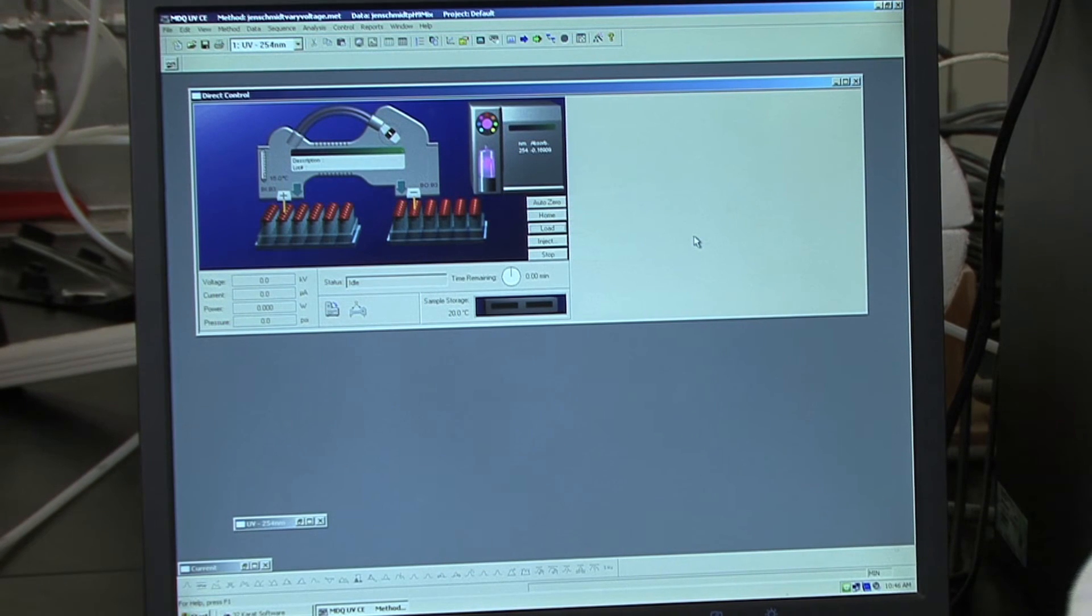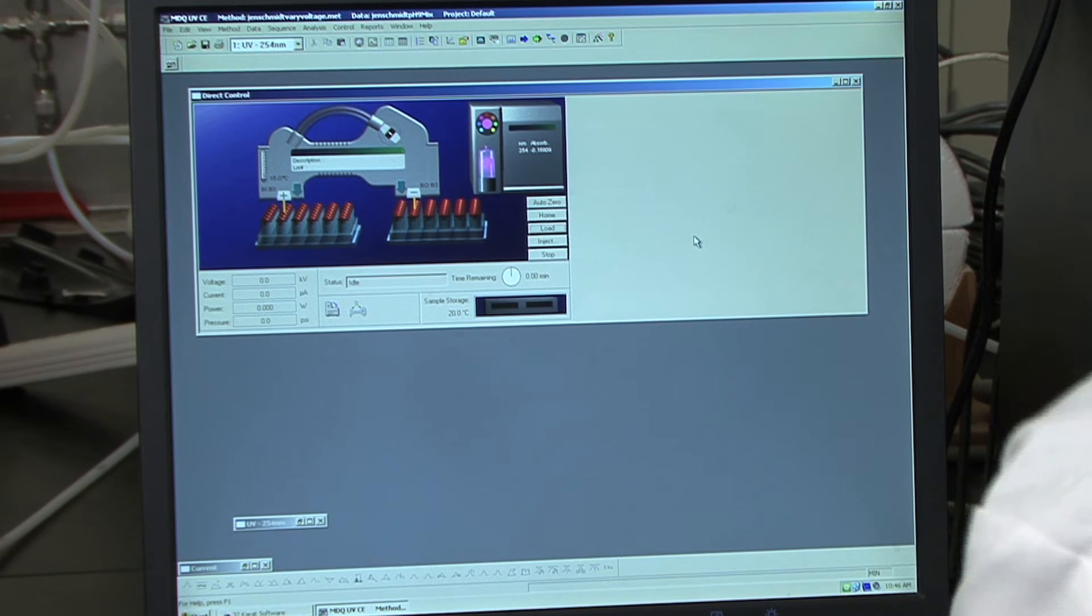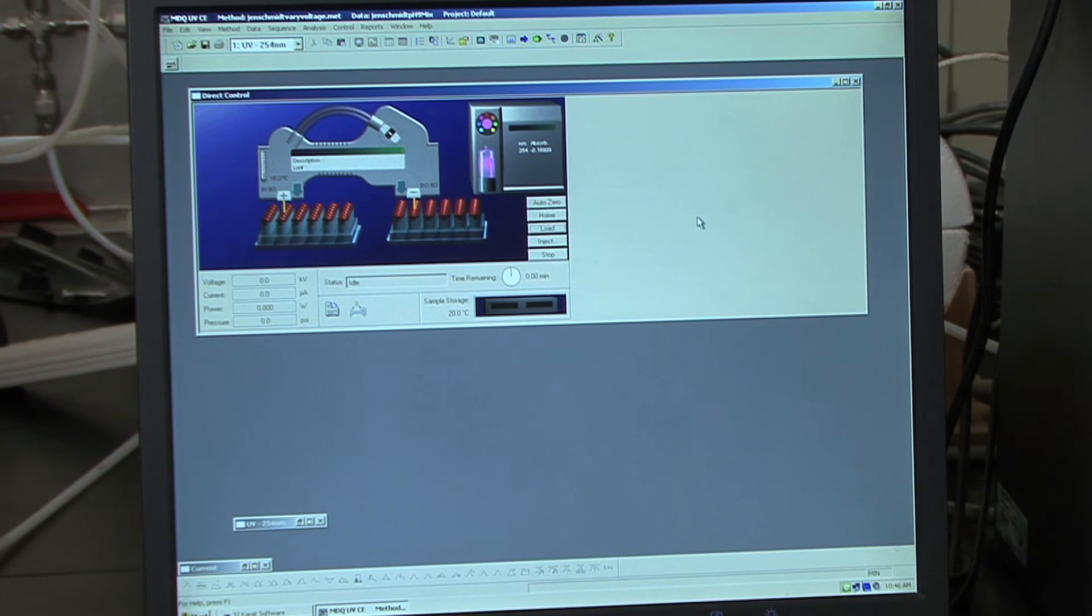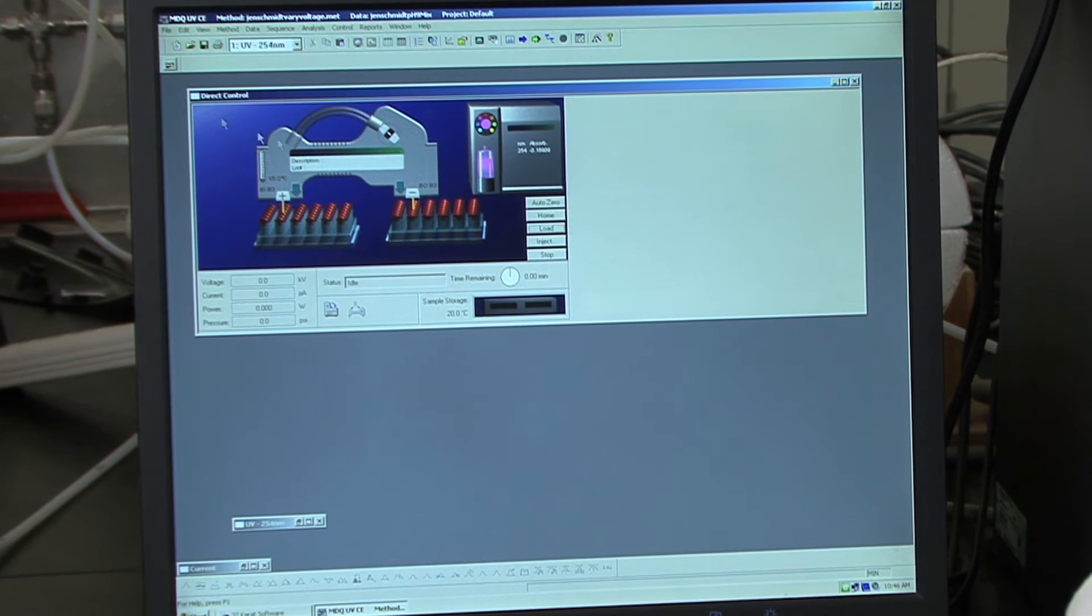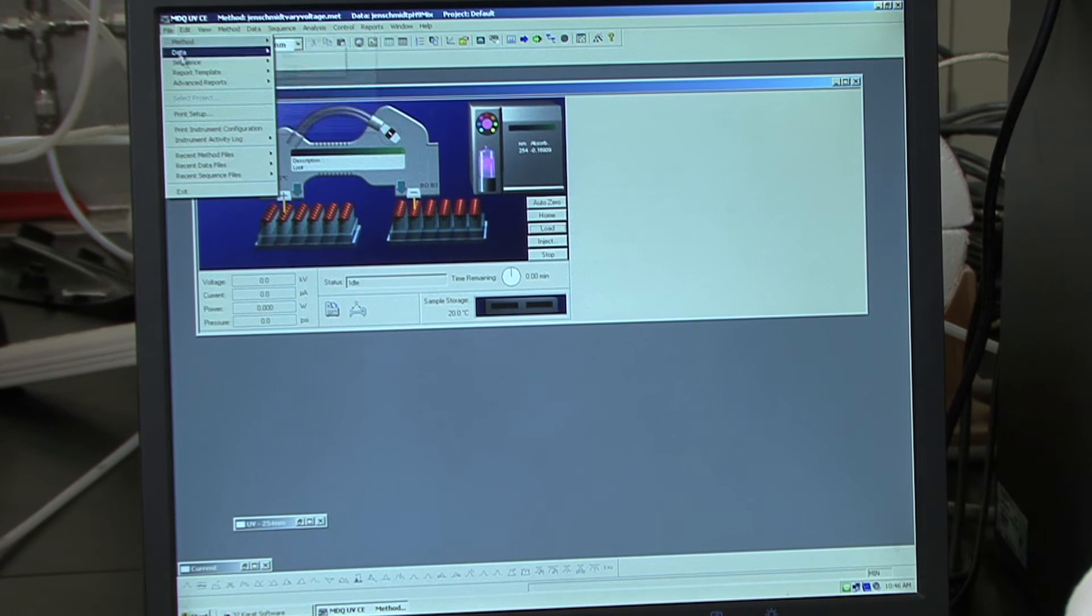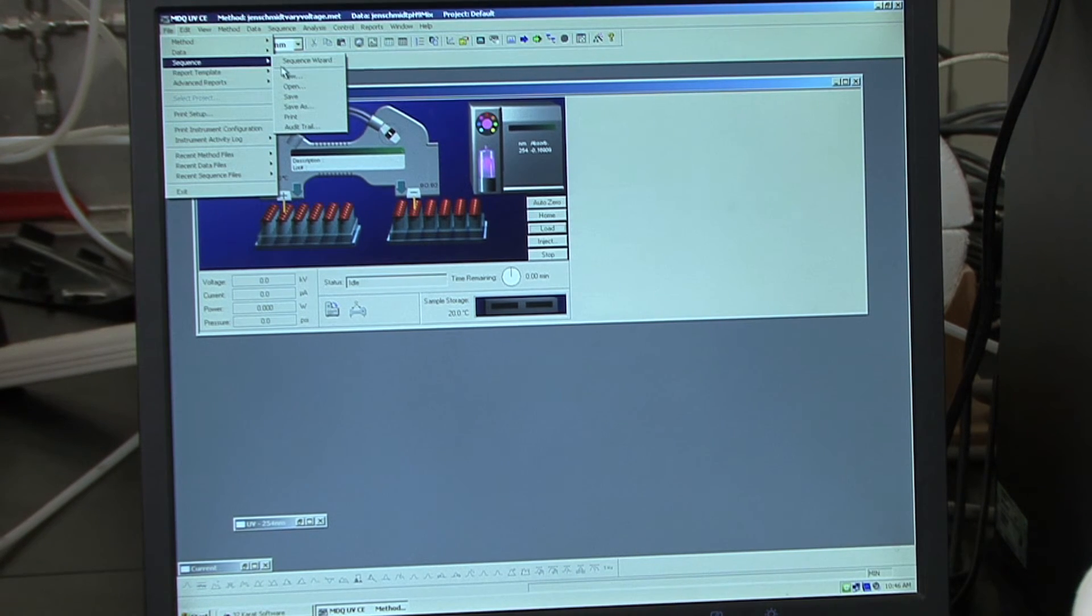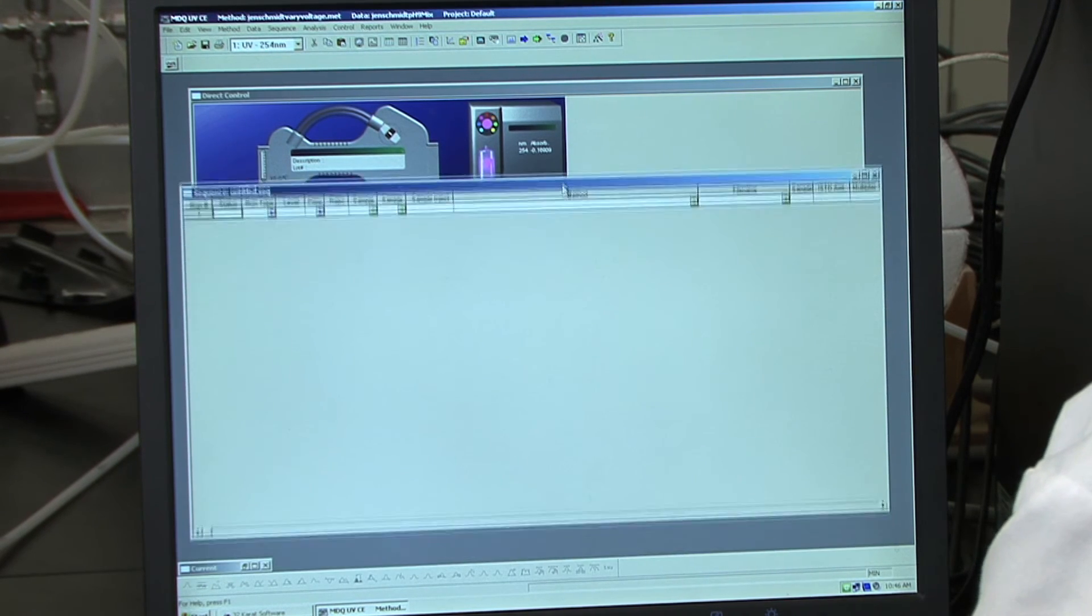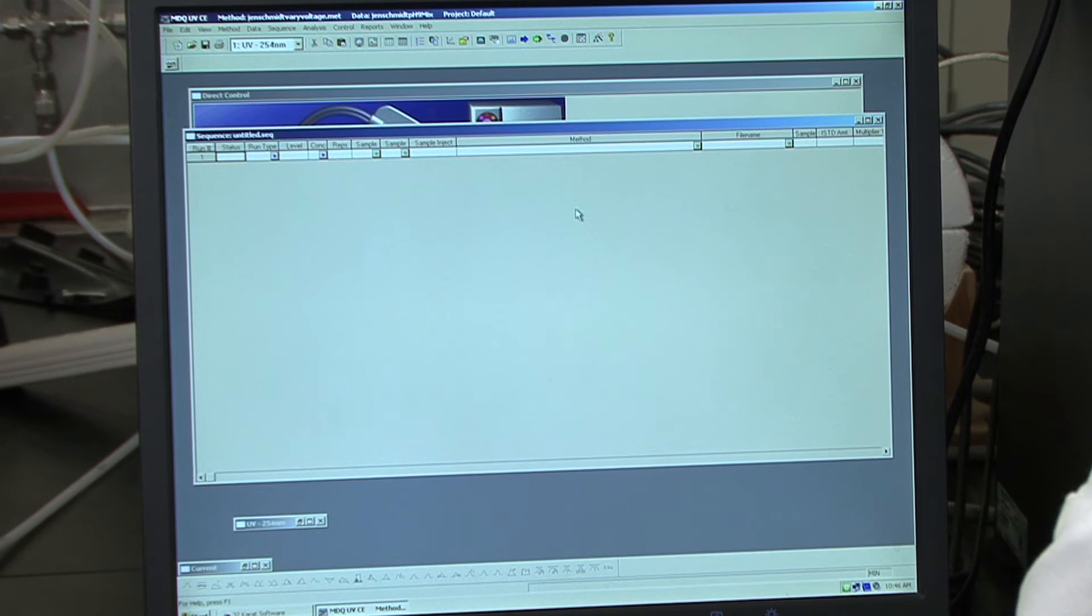Once your variable voltage method has finished running, and you have selected your optimum voltage, you can create your pH optimization sequence. So to do that, we are going to go to File, Sequence, New. And this will bring up a blank sequence window.